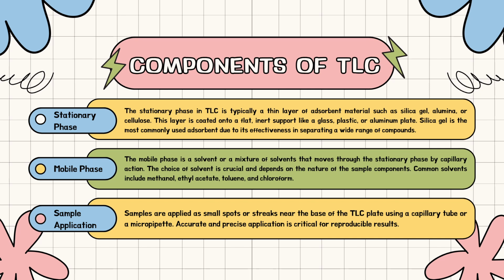The sample application will proceed by applying a small spot or streaks near the base of the TLC plate by using a capillary tube or a micropipette. Ensure to apply it accurately and precisely for reproducible results.